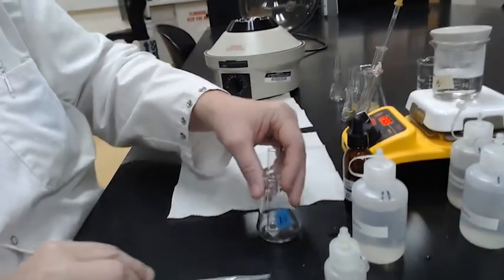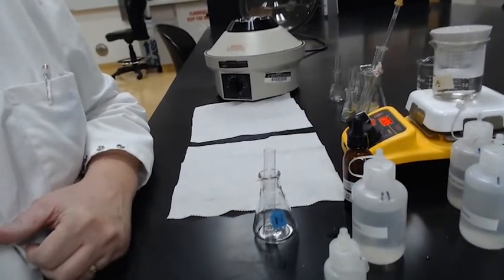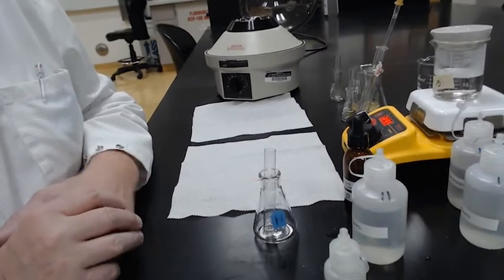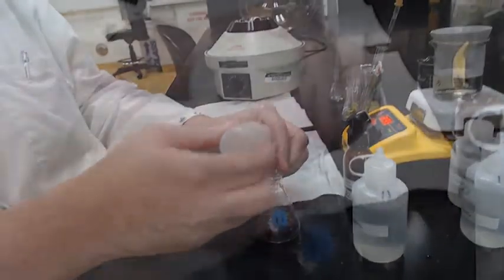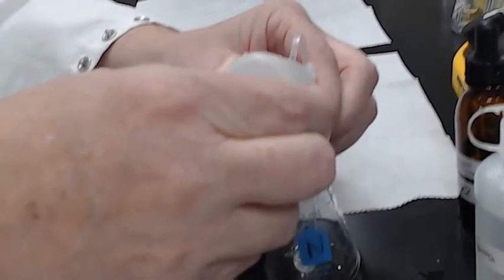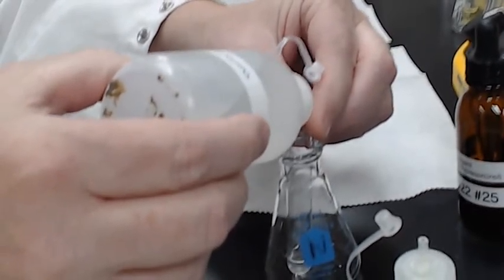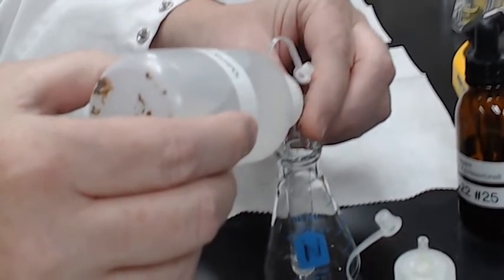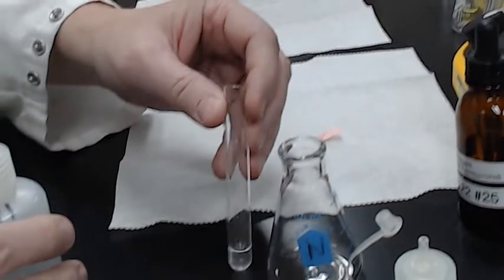With what's left here, we're going to do the possible magnesium test, and that is first done by adding a drop of the 5 molar ammonium hydroxide. That's going to make it slightly basic. Okay, we added the drop, and then we're going to add 4 drops of the sodium biphosphate. The idea being, will it precipitate? Because phosphates precipitate with magnesium, calcium, and barium. And this one's questionable.